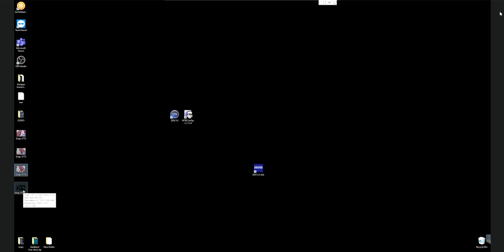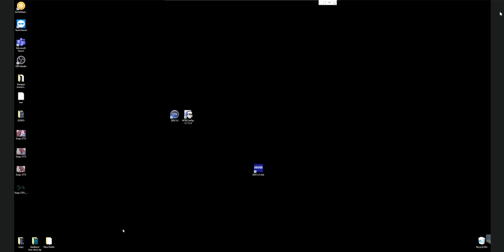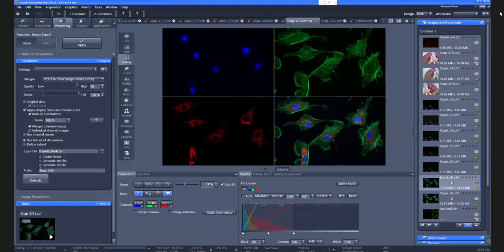Okay, so it's this one, I guess. Yeah. Okay, it's the merged one. And where do we get the single channels? Okay, maybe I missed it. Individual channel images. Sorry, let's do it again.